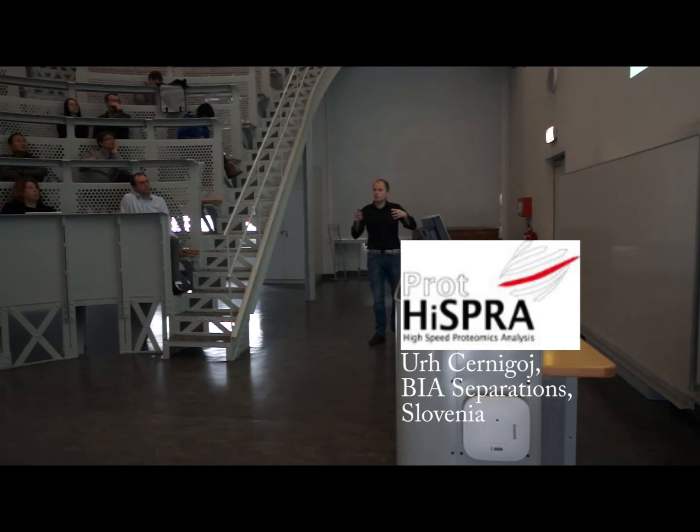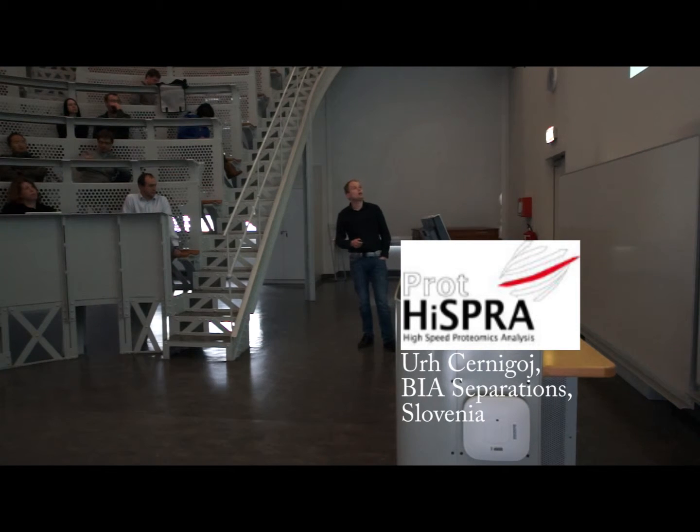In this way, getting much higher surface area. This was our expectation, and to have the very stable layer of nanoparticles on the surface of the organic monolith. Indeed, we studied at the beginning different, let's say, activation chemistries, even though they are not really activation chemistries, but we started with two different matrices, and we studied two different crystalline structures, the rutile and the anatase nanoparticles. And with both, we succeeded later on to get the layer of nanoparticles on the surface.